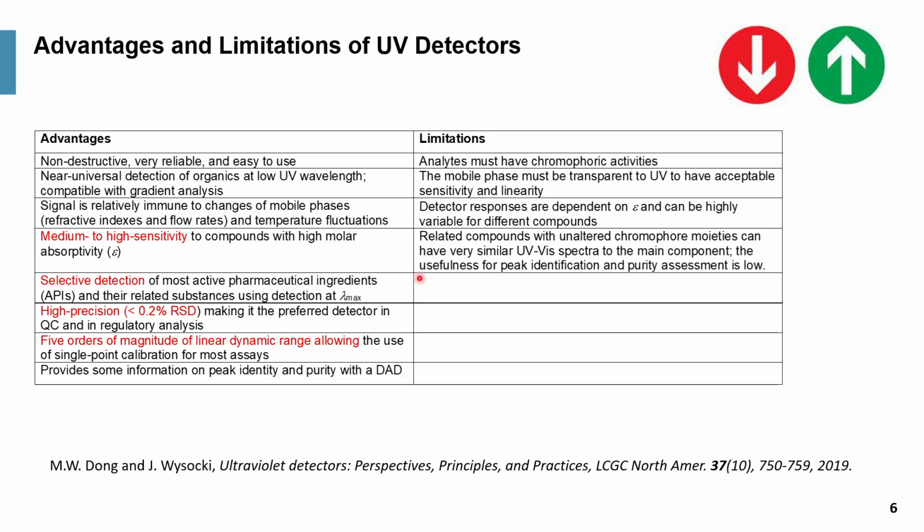There are indeed some limitations. First of all, the analyte must have chromophoric activity. Without that, it would not be compatible. And also the mobile phases must be transparent to the UV to have acceptable linearity and sensitivity.